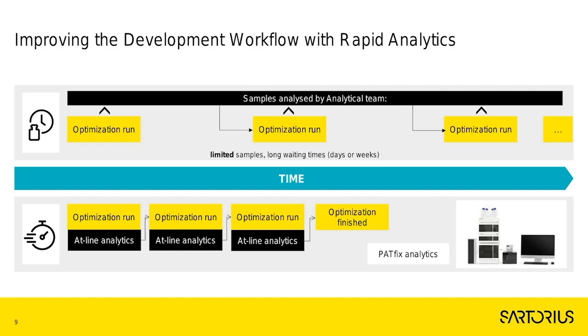But more than that, because this is a rapid analytical method, taking about 30 minutes to analyze one sample, it means that you get this critical parameter on optimizing your encapsulation at line as you're working to optimize your process, instead of sending them off to a lab to be analyzed later.